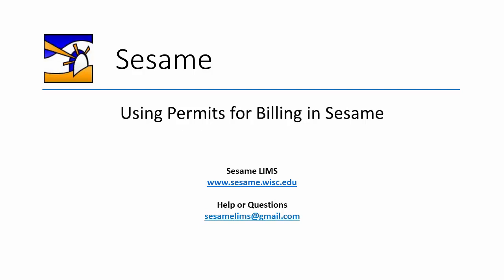Hello and welcome to this video tutorial about using the Permits Lab resource in Sesame. For this tutorial, we will use the Sundial module.